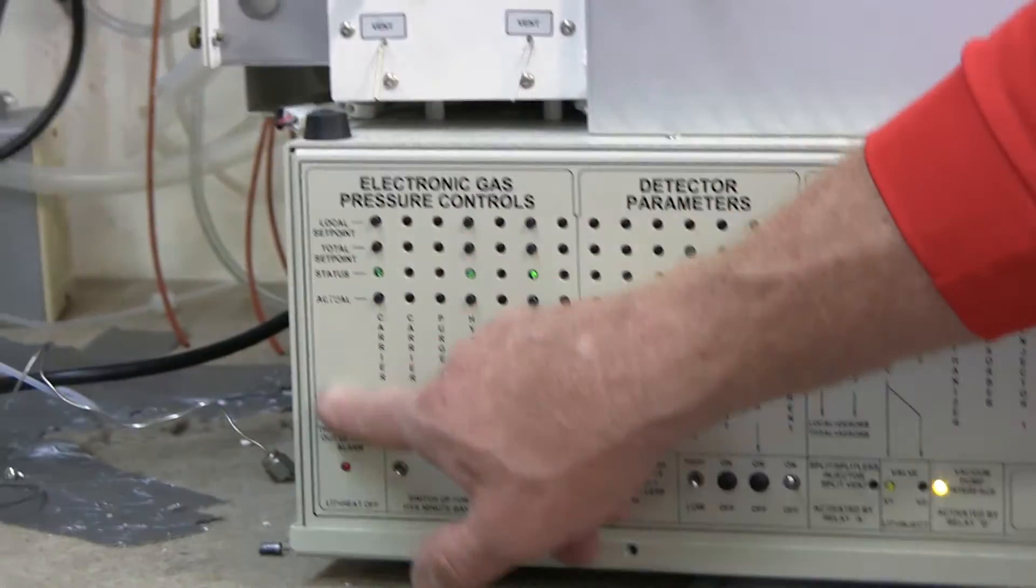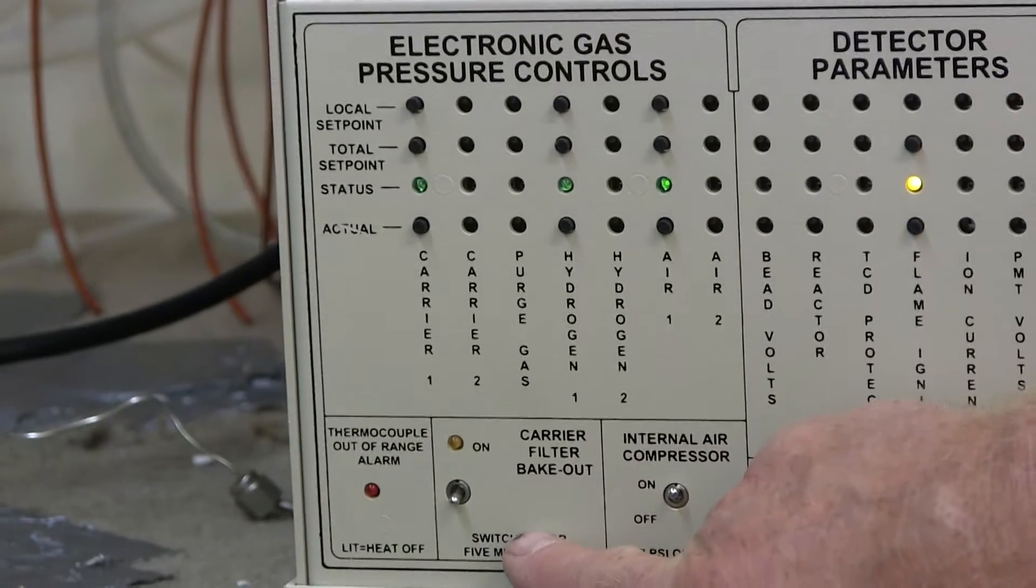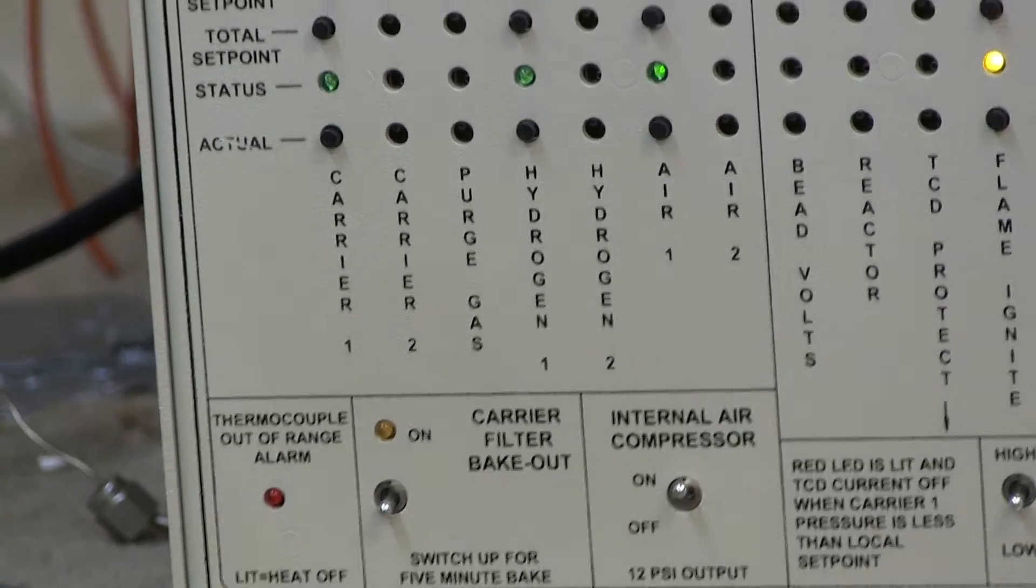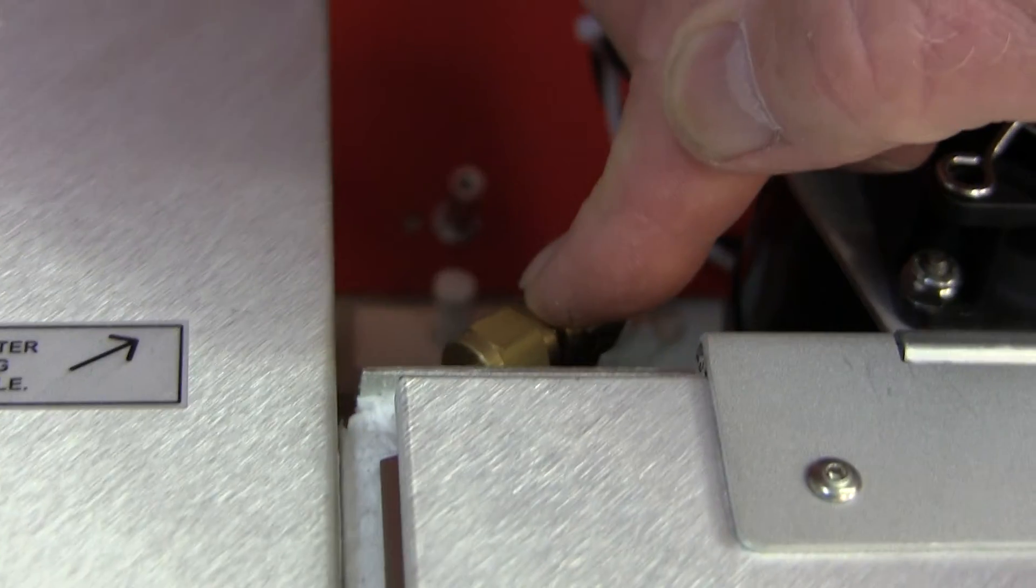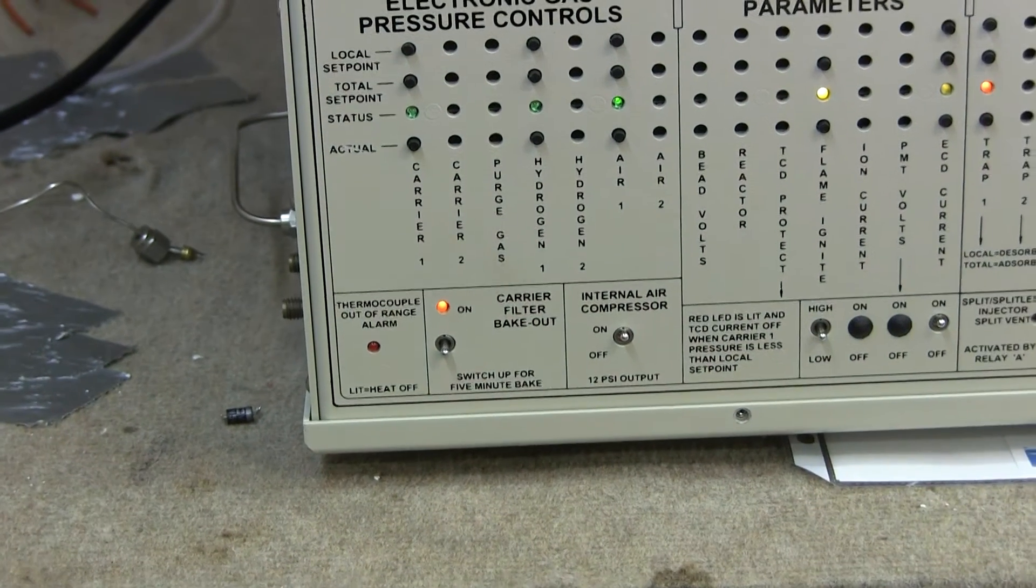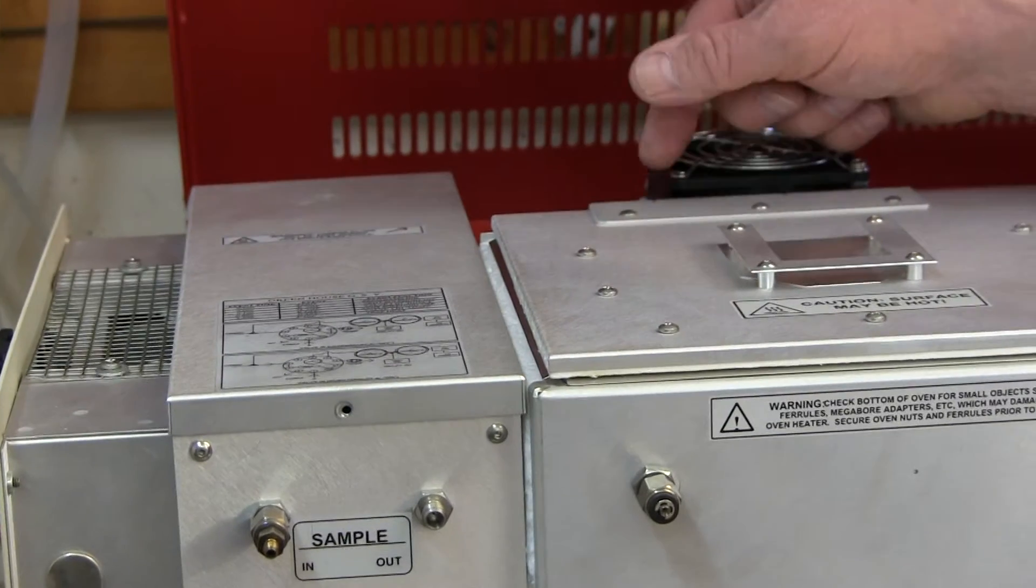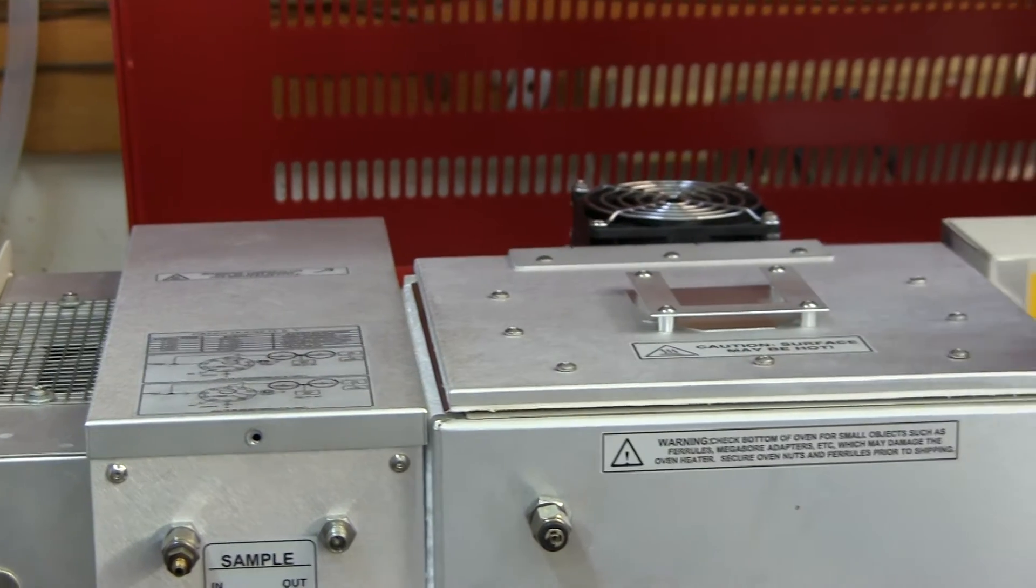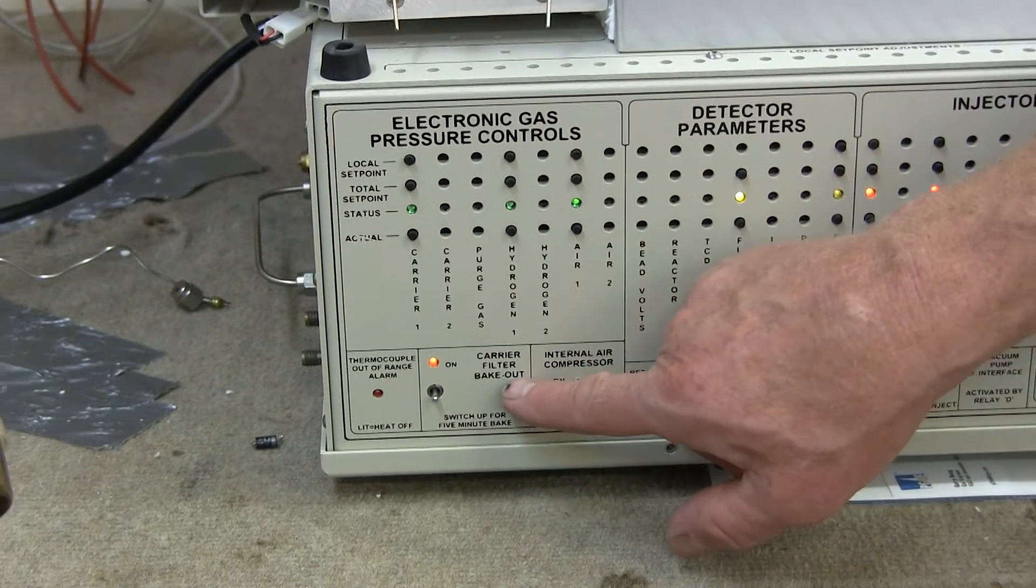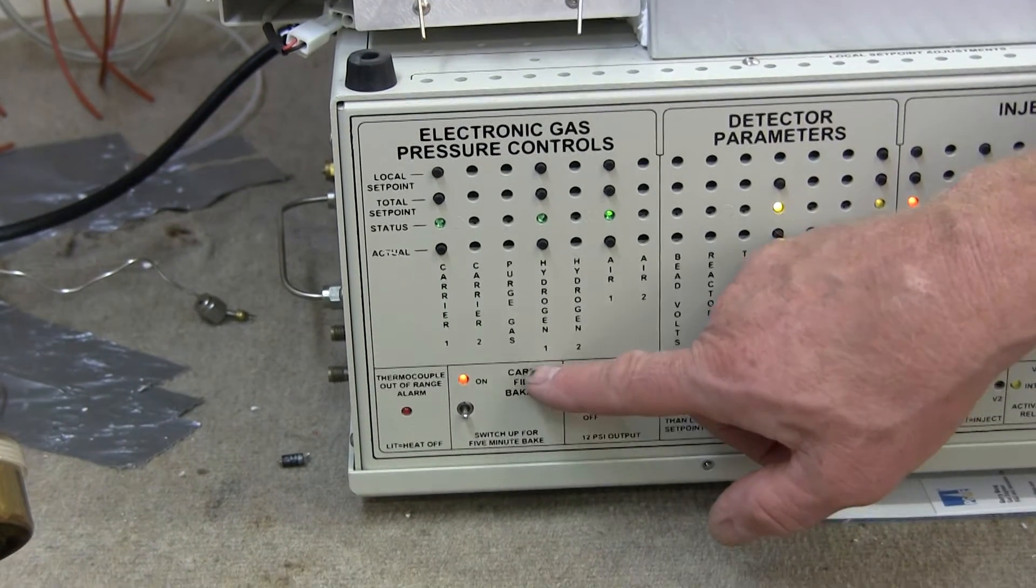Going back to the left hand side of the front of the GC, we see that we have something called a carrier filter bakeout. The carrier filter bakeout is something that we have built into the GC that heats up a little filter. The filter is actually located right here where my finger is. It's a little tiny tube, three inch long tube filled with molecular sieve, encased in a heater jacket. If you want to bake that filter out, you can flip this switch up. When I flip the switch up, it's a spring loaded switch, the light lights and it'll stay lit for five minutes while it heats that filter up. The carrier gas goes through that hot filter and pushes the contaminants out onto the column. You really only need to use it if you think that you have some problem with your carrier gas.